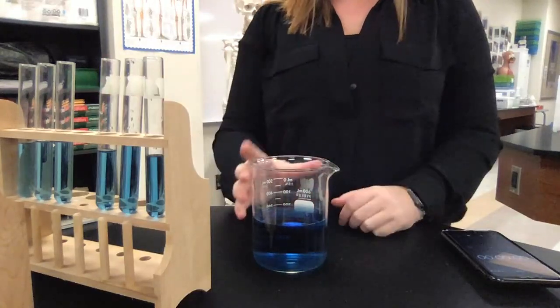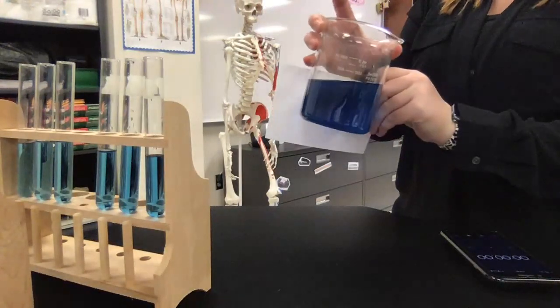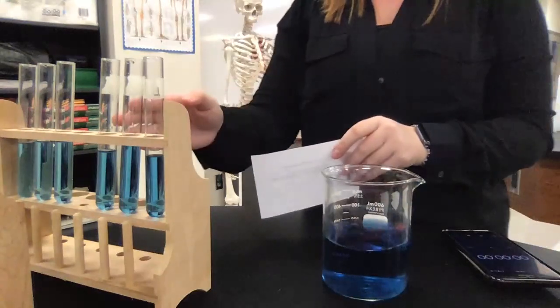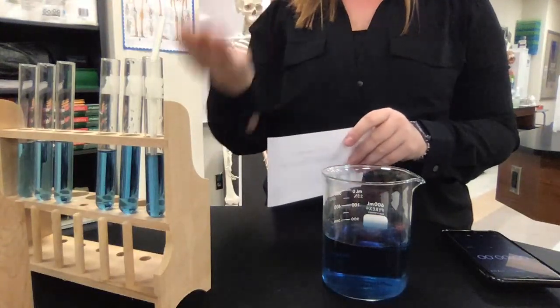So the first thing I'm going to do is talk about the setup. I have a solution of Bromothymol Blue, and as you can see, it is a blue solution. I have some test tubes set up here that are just numbered 1, 2, and 3. And I have a straw — that's how I'm going to put my breath into the solution.